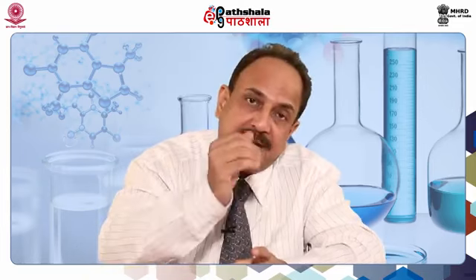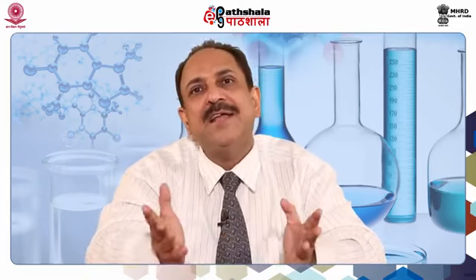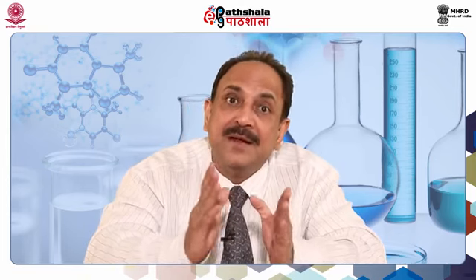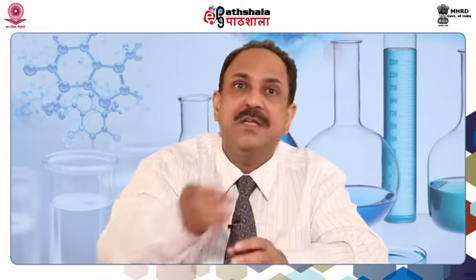So, by detecting the binding residues and adding the catalytic residues from the literature, we can complete the active site of the enzyme. This will help in understanding the way in which the active site is transforming the substrate into the product.